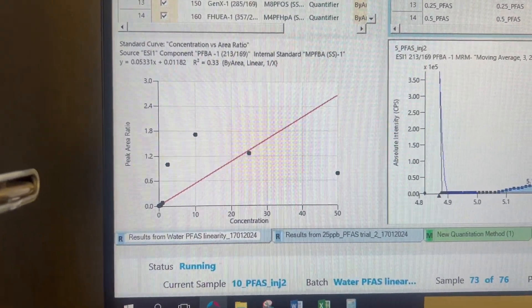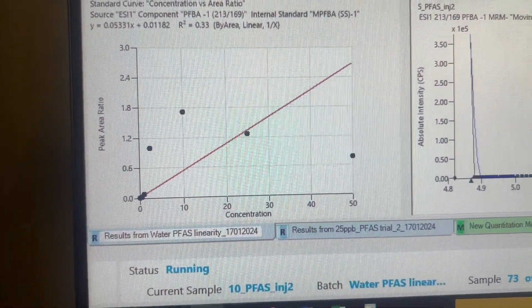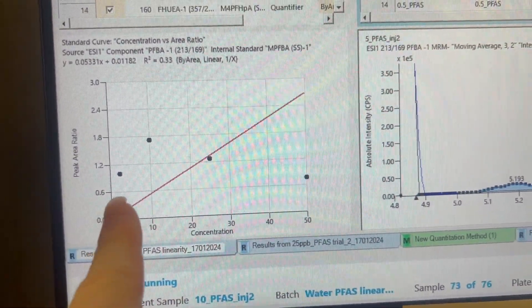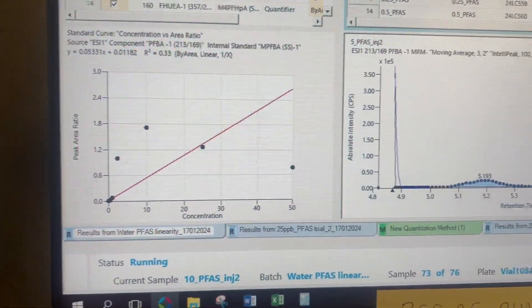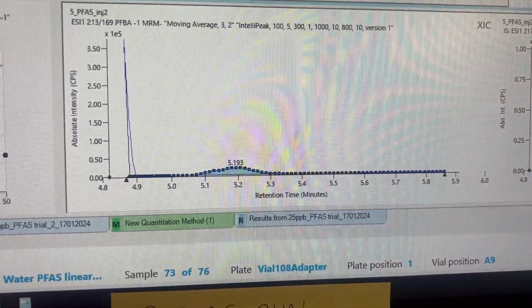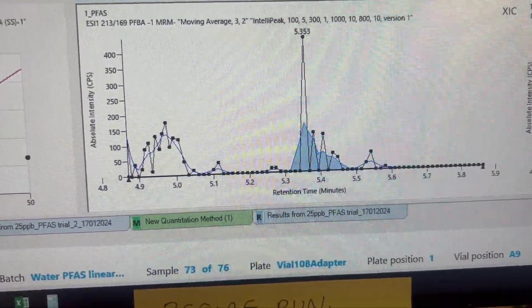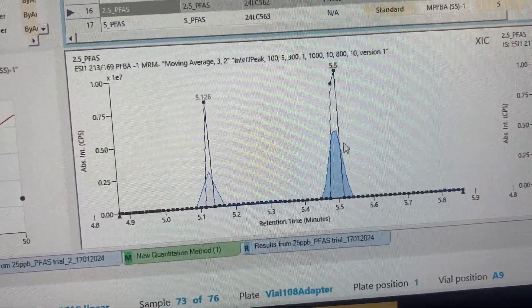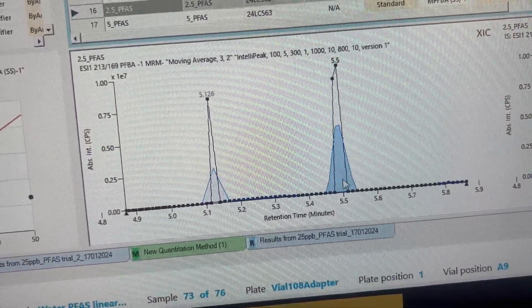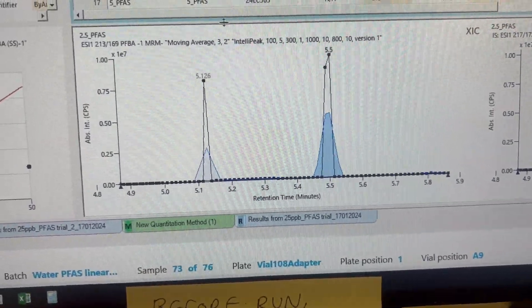This is one of the calibration curves that Sarah sent me yesterday. As you can see, that is not a calibration curve at all. These points should all be straight — there should be an R squared of 0.99. This analysis is a bit tricky in the sense that weird things happen sometimes. Look at this — what is this? This is not a peak. That's a peak. This is not a peak either. There are four points but look at the intensity, it's so high. So something strange was definitely going on.